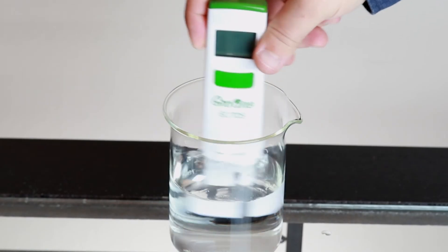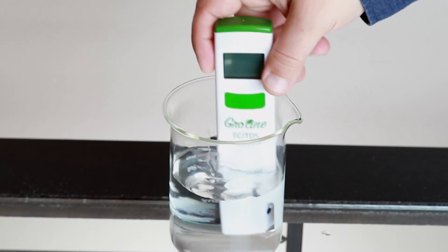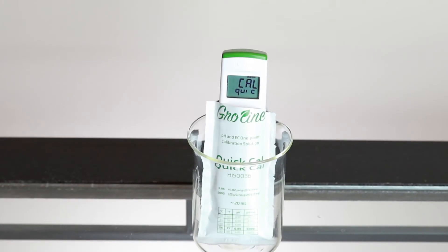Once your settings have been set to your preference, the tester is now ready to be calibrated. Calibration is an important part of keeping your tester operating at its best — we recommend calibrating before each use. To calibrate your tester, press the CAL key, rinse it in distilled or deionized water, and place the tester in your HANA GroLine quick CAL calibration buffer.